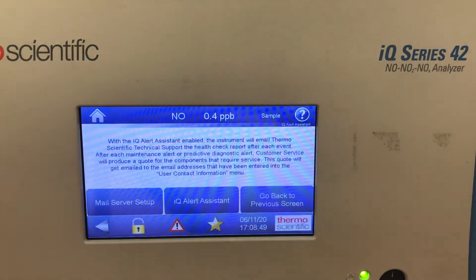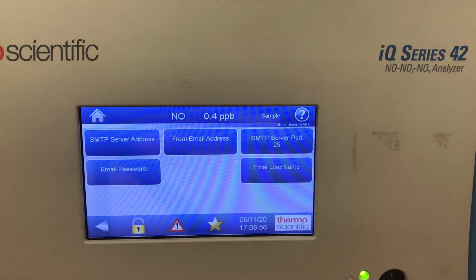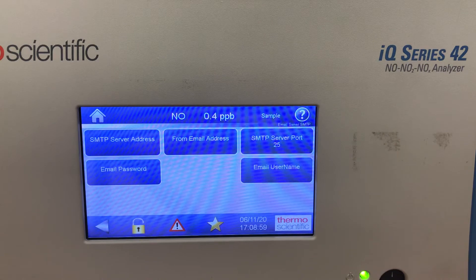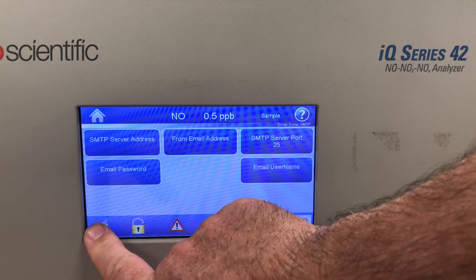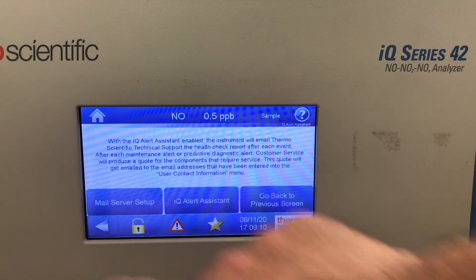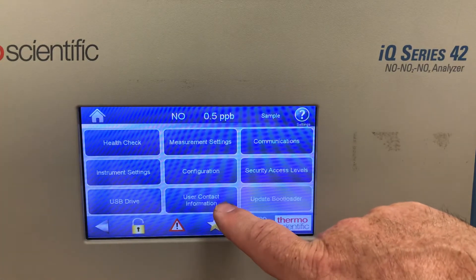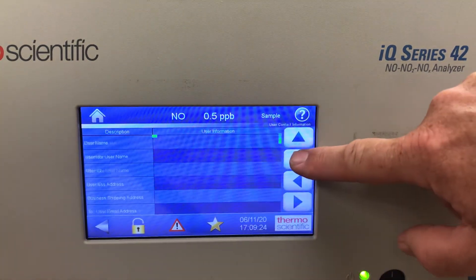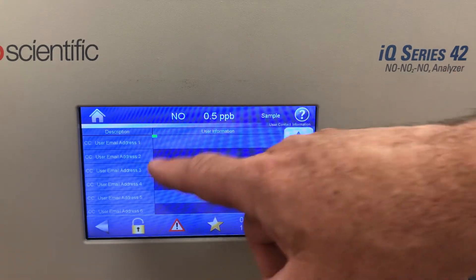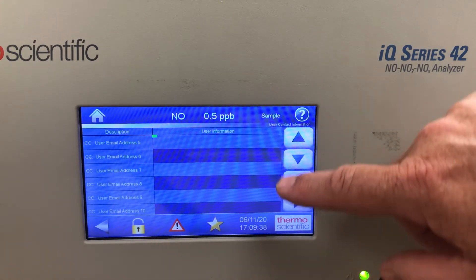The IQ alert system can be set up here, along with the mail server setup — where you configure the SMTP email, password, and server port for sending out messages. To show you where the email setup is: go to the home screen, settings, and then contact information. Your information goes in the top part, and if you scroll down you'll see there are 10 different email addresses you can add. Any alerts or health checks can be emailed to any of those addresses.